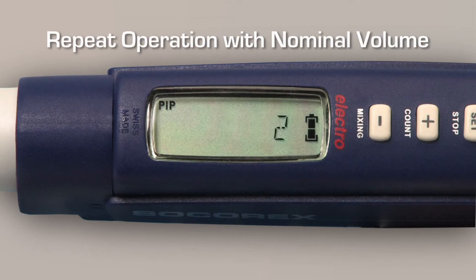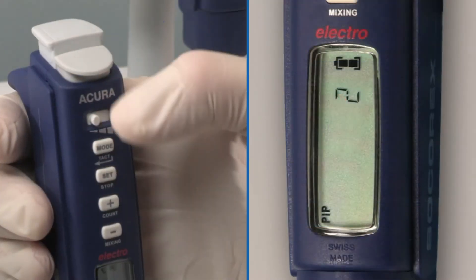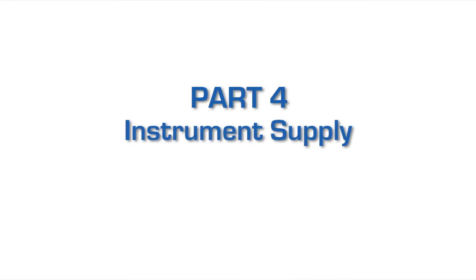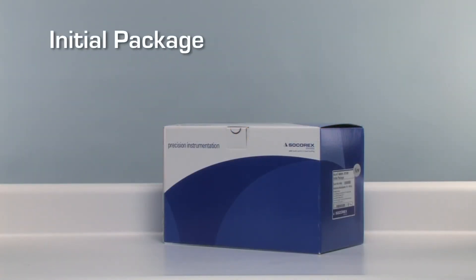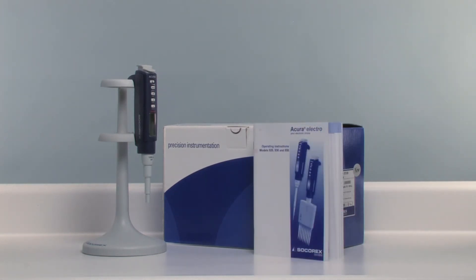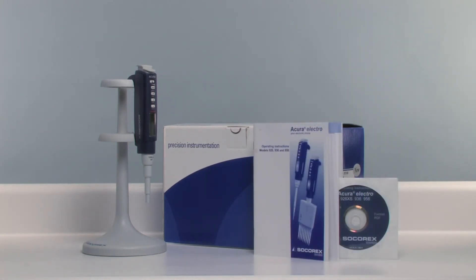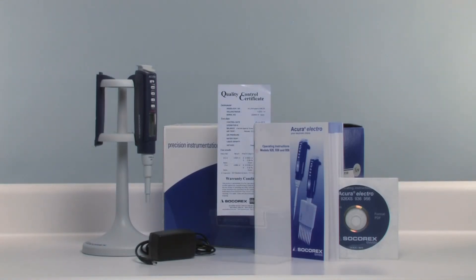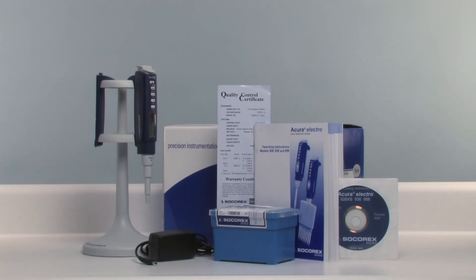To the calibration value indicated on the display, add or retrieve the number of calibration units. Repeat the operation with a nominal volume. When calibration is completed, press the mode key to return to the pipetting modes. The initial package is recommended when purchasing an Acura Electro for the first time. Each initial package contains: a charging stand, an electronic pipet with a battery pack, operating instructions as a booklet and a CD, a QC certificate, a power supply, an additional battery pack, and pipet tip samples.